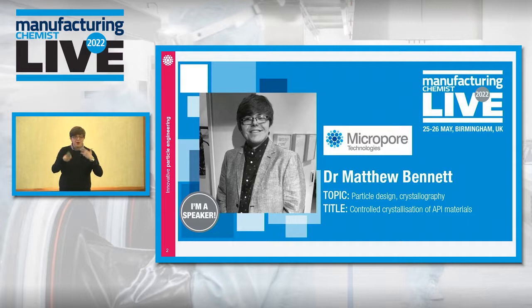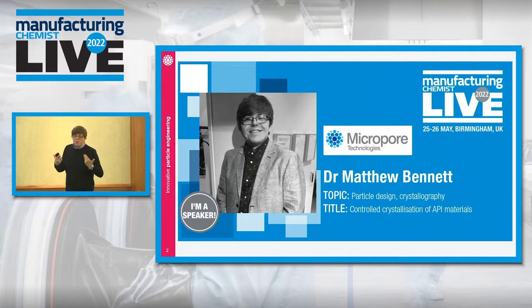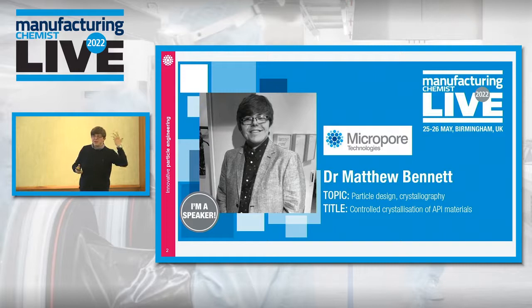So, again, the company I represent is Micropore Technologies. I don't know if anyone here has heard of those before, but just to put a bit into context, Micropore Technologies, we'll go into more detail about this, by the way, mainly focuses on emulsification work and emulsification formulation sciences. However, a couple of years ago, someone actually used one of our specialized equipments, not for emulsification, but for crystallization, completely different field. And as such, about 18 months ago, the company were like, this is looking promising, let's go get someone in. Unfortunately for them, the person they ended up with was me.